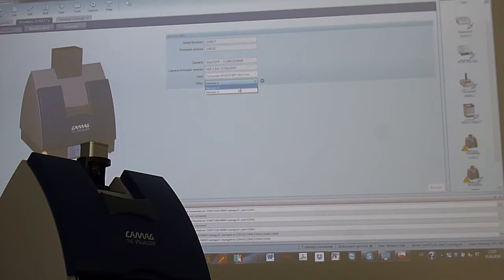At the moment it is not fully implemented. The visualizer 2 is implemented in the next version of Vision Cats. So around October or so there will be a new version of Vision Cats. The only thing is some bug fixing and Visualizer 2 implementation. In October, yeah.